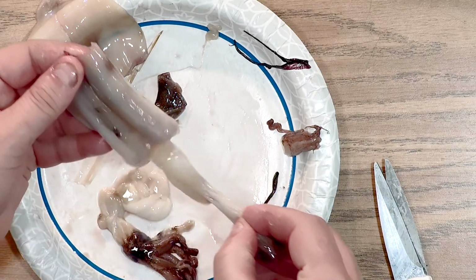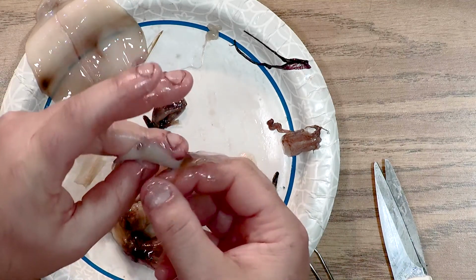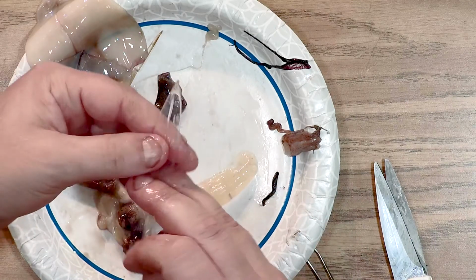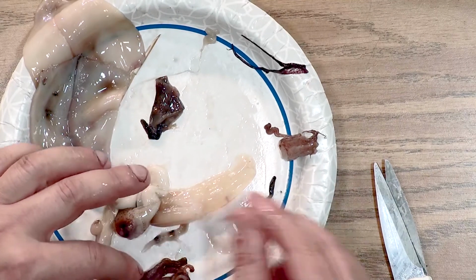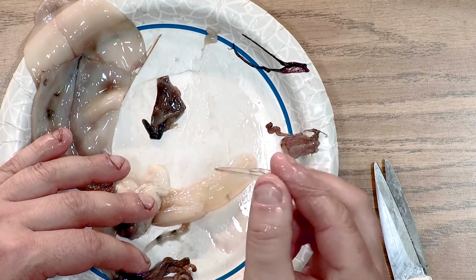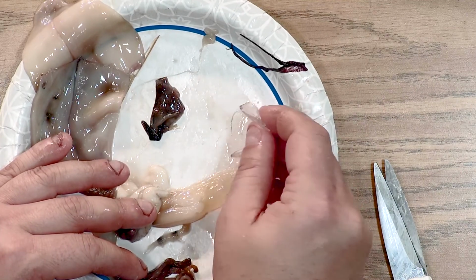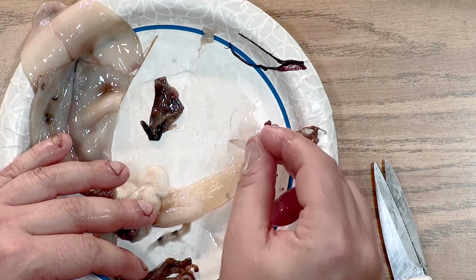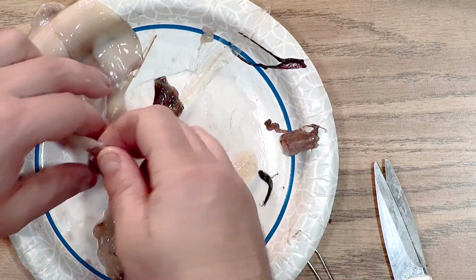Now I'm going to do the same to this one and separate it. And I'm going to take the pen out. Now I could actually use this shell or this pen to poke into that ink. Notice it's kind of like a pen shape. And I could poke into that ink and try to write something. Oh, see that? I was able to make that mark from the ink with my pen. That's pretty awesome.